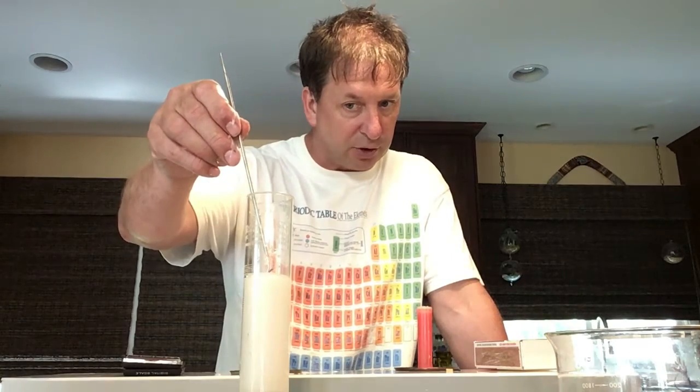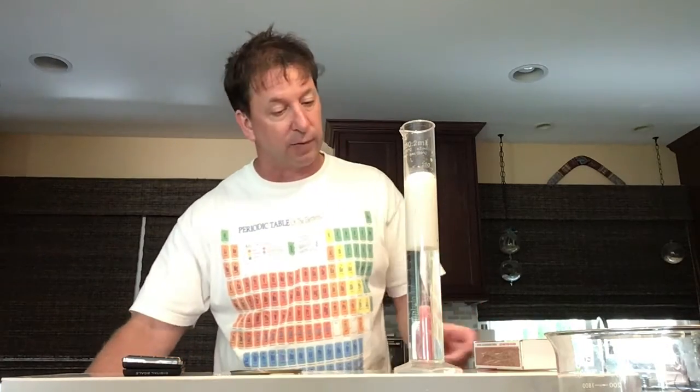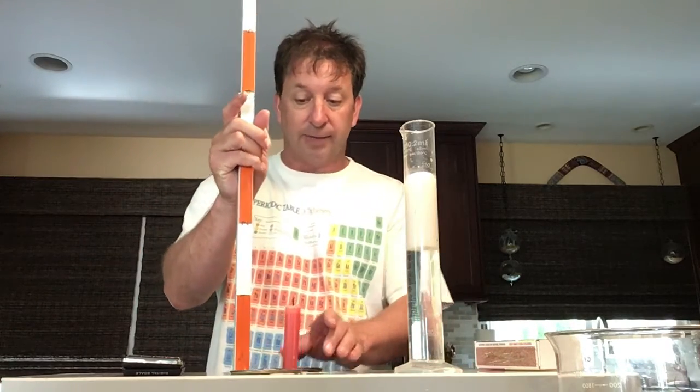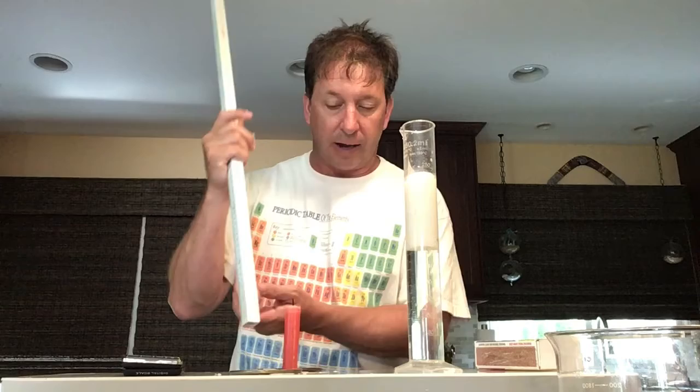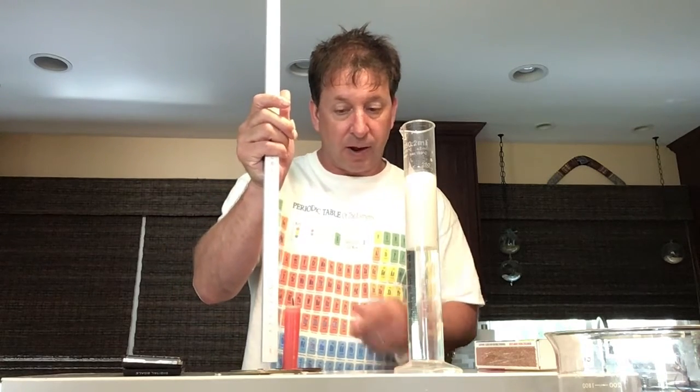So as a result of pushing it down, we record our new volume, and we see if the volume changed over time, and we'll see if the mass changed over time. Oh, we forgot about height. We can also record the height and see if the height changed over time. Notice we will have to record the initial and final time that we let the candle burn for, as well as our initial mass and our final mass, and our initial volume and our final volume. So we'll record all that information.